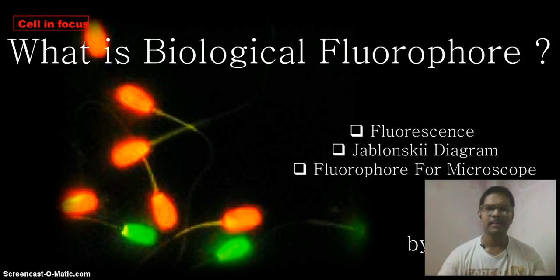So whatever the excitation, whenever we are giving some light, some energy, light is nothing but energy, then the electron, meaning you, is getting excited. You are excited to the first floor. Excitation can be to the first floor or second floor or third floor, anything. But whenever you are returning back, you have to first come back to the first floor, and then from the first floor you can go to the ground floor by the downstairs. So that is the important thing.